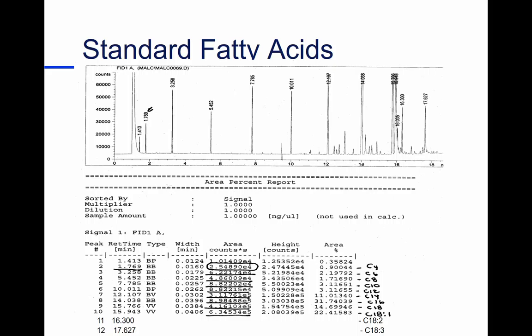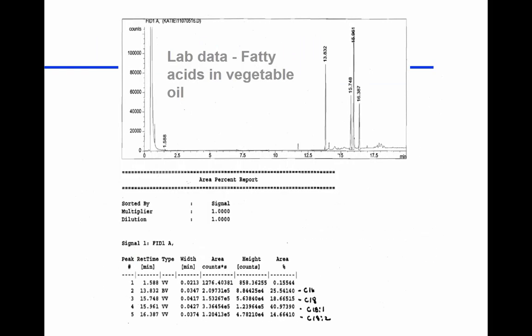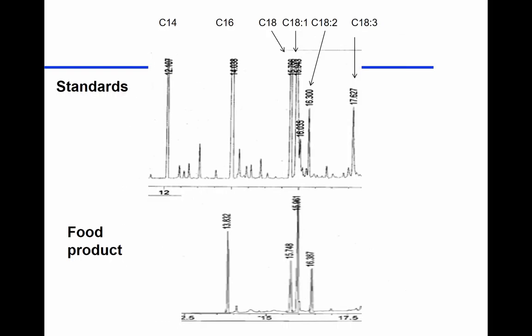Oh, this is a plant source. This is an animal source. This is a certain type of plant. So you'll get something that looks like this. And again, you can take those times and go ahead and compare them to the standards. You should have a standard gas chromatogram, I think, or times given to you, let's hope. And then by comparing to the standards, here are the standards, here is your sample. You can say, okay, that's palmitic acid, that's stearic, oleic, linoleic, and there's no linolenic in this sample.